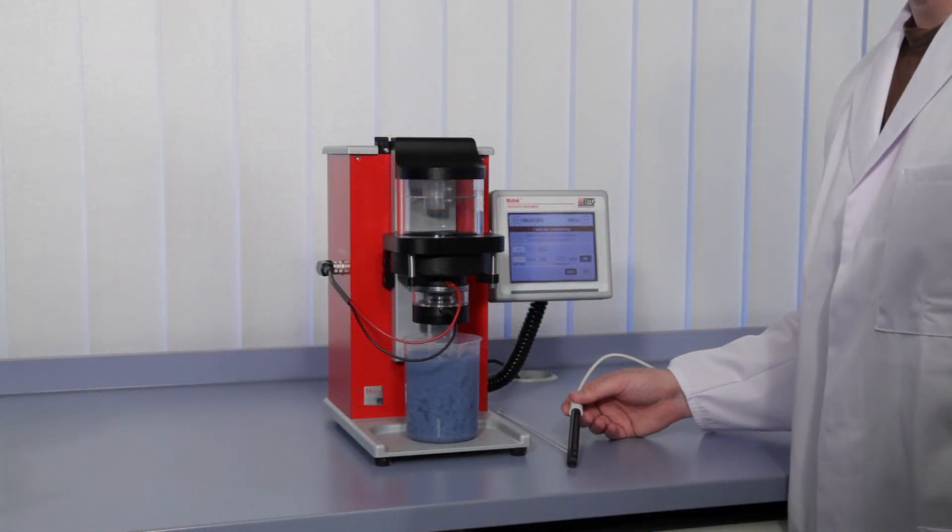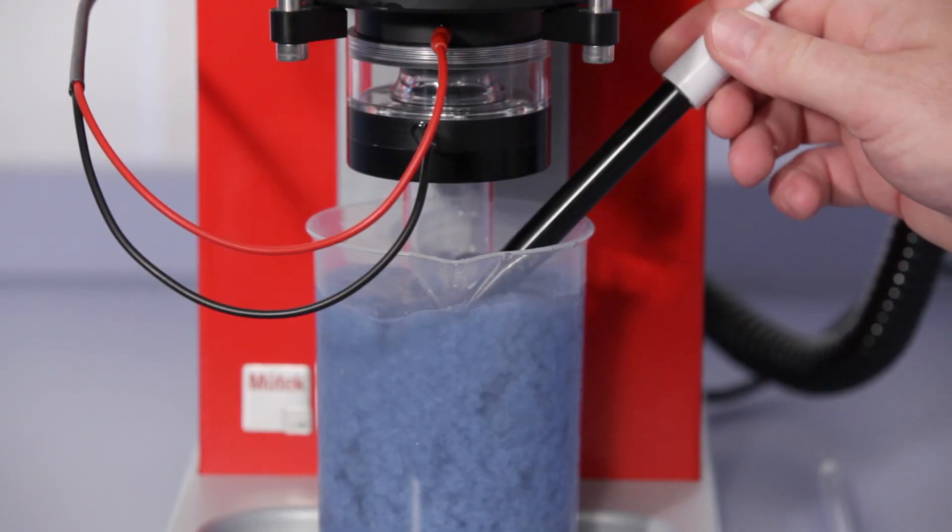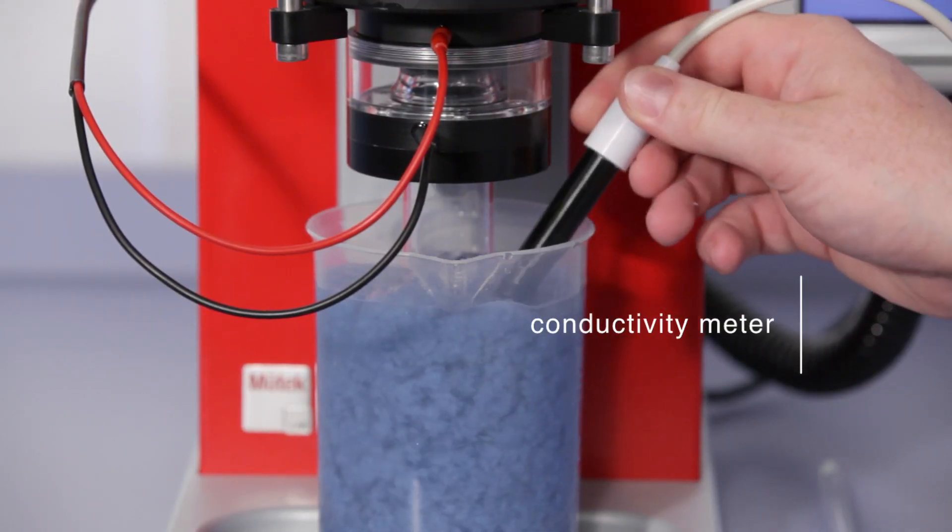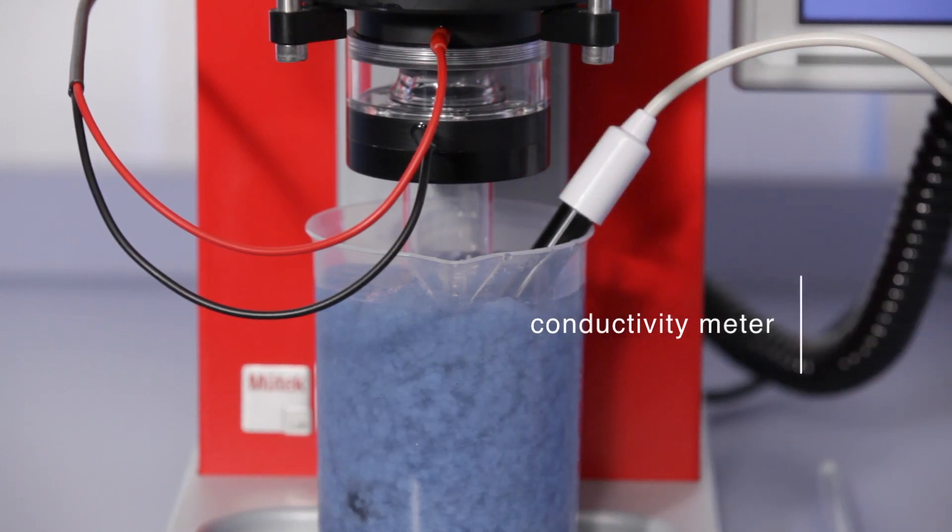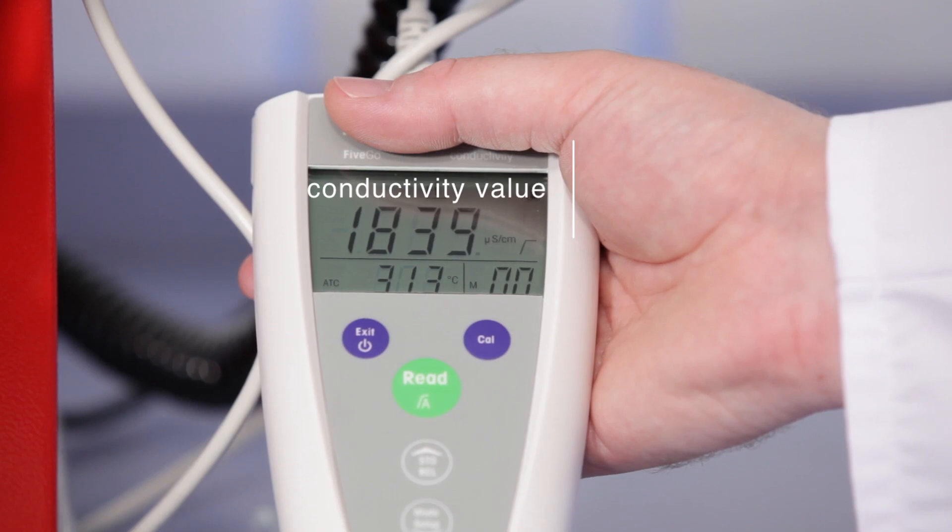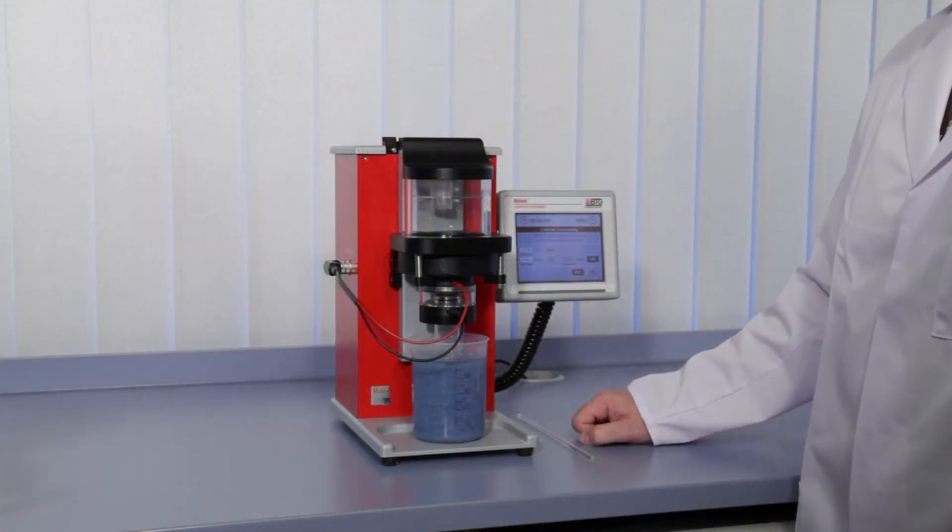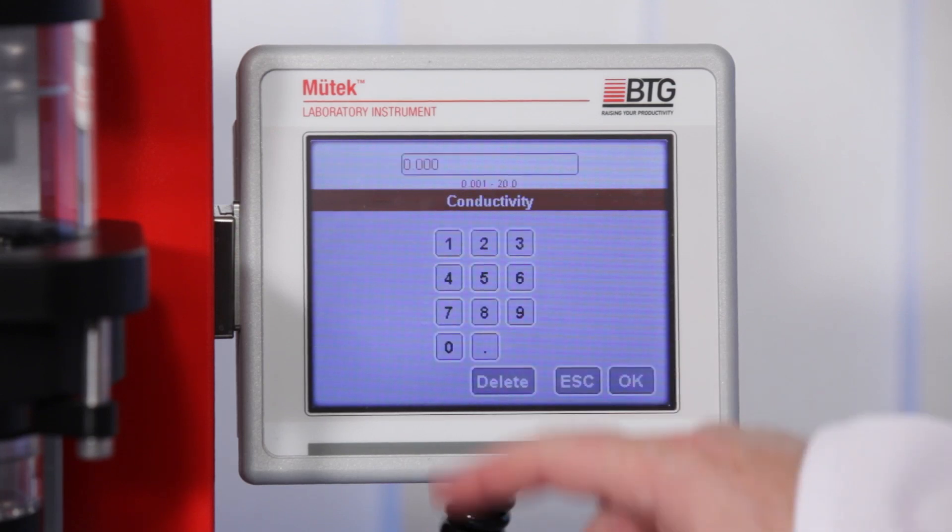Now, an external reference value for conductivity is required. Use a calibrated conductivity meter with the temperature compensation switched off. Note this conductivity value and type it into the conductivity field.